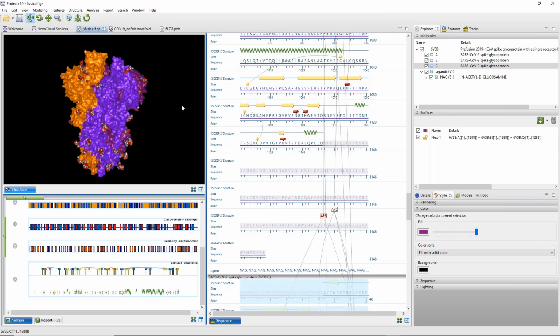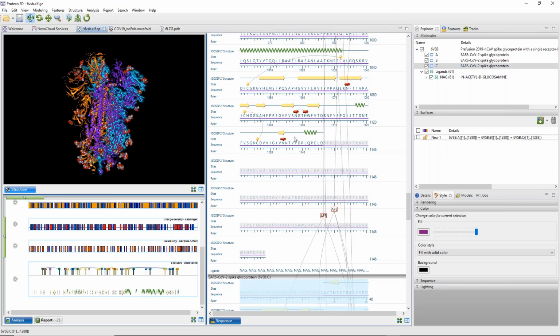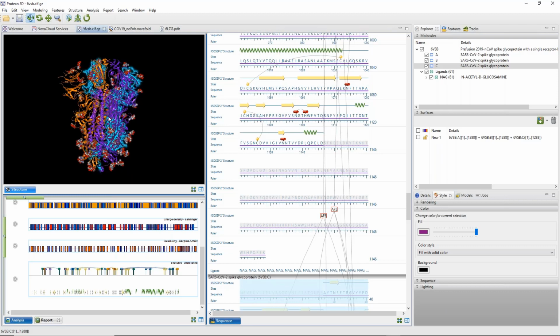Now, this model has a couple of issues with it that I want to point out, that's interesting, and how NovaFold, the tool that produces our structure predictions that Katie was mentioning, can help assist with the issues that this model had, and how we could have had a better chance in the beginning by using a workflow such as I'm going to present today.